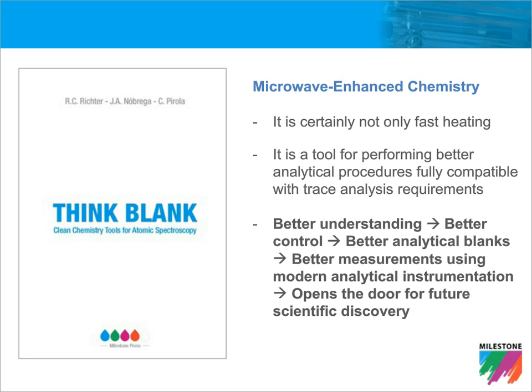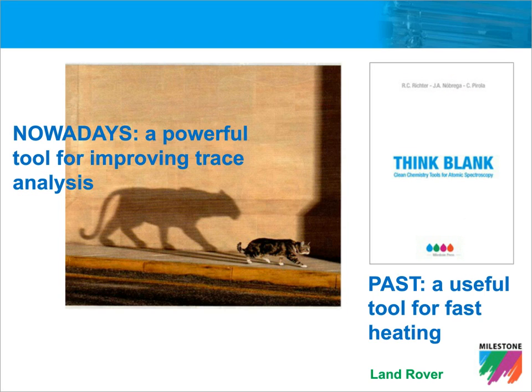We may say that in the past, microwave was seen as a useful tool for fast heating, but nowadays microwave is a powerful tool for improving trace analysis. This is the main point that we stress in this just published book.